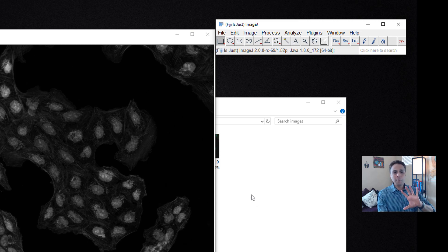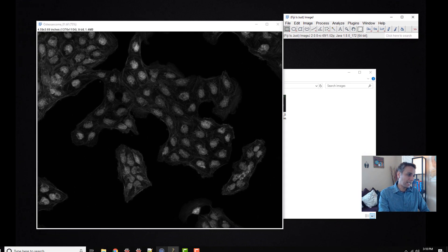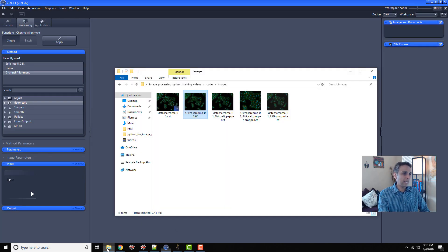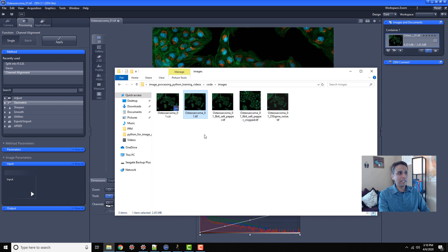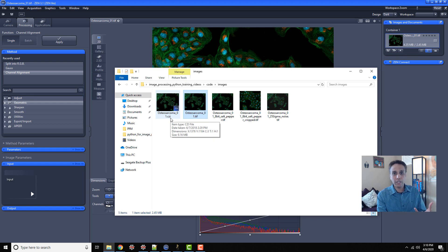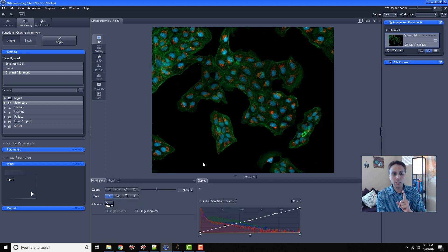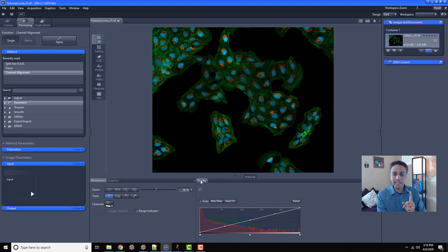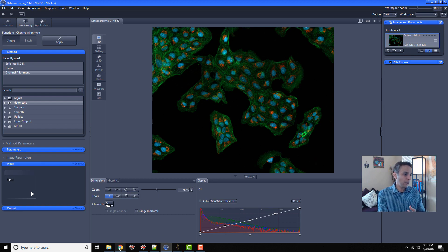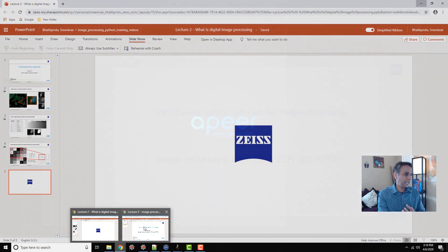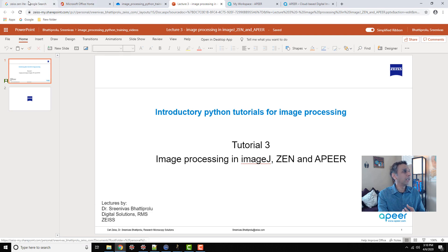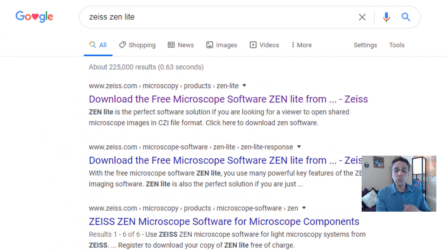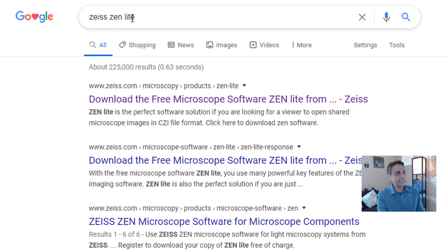This is a basic image operation in ImageJ and Zen. Let's load the same image in Zen. I'm just going to drag it. If I drag the CZI image, I can also do the same, but let's stick with the same image. Now, in case you wonder what Zen is, and if you have never worked with Zen, or if you want to get your hands on Zen, go ahead and type Zeiss Zen Lite in Google search.